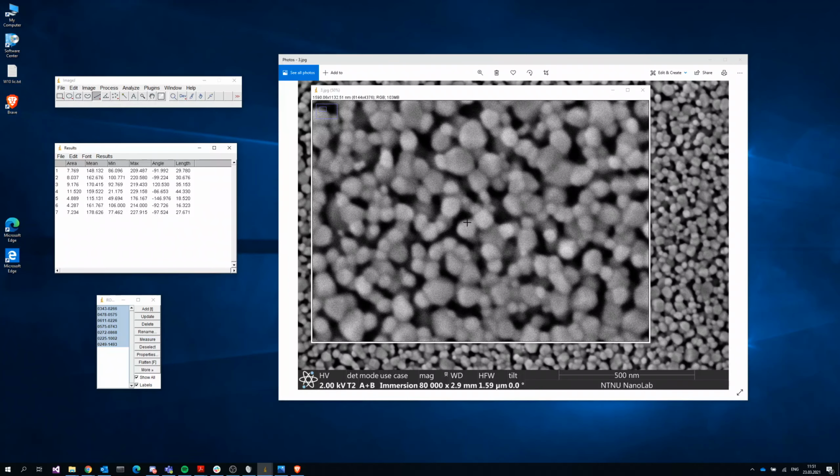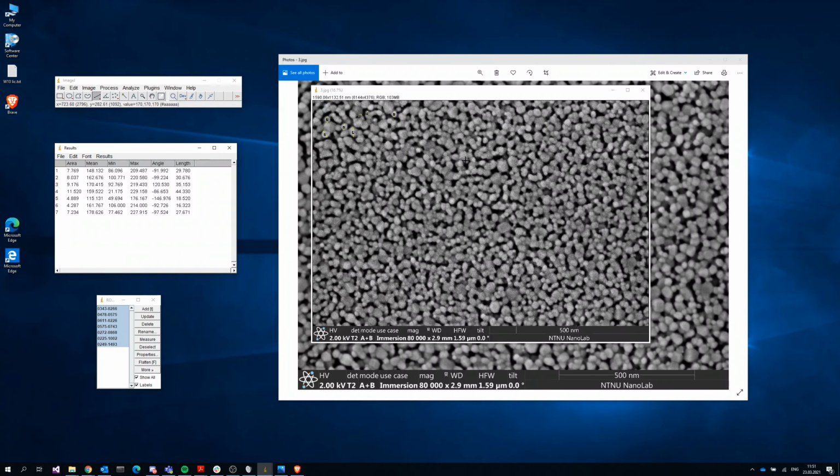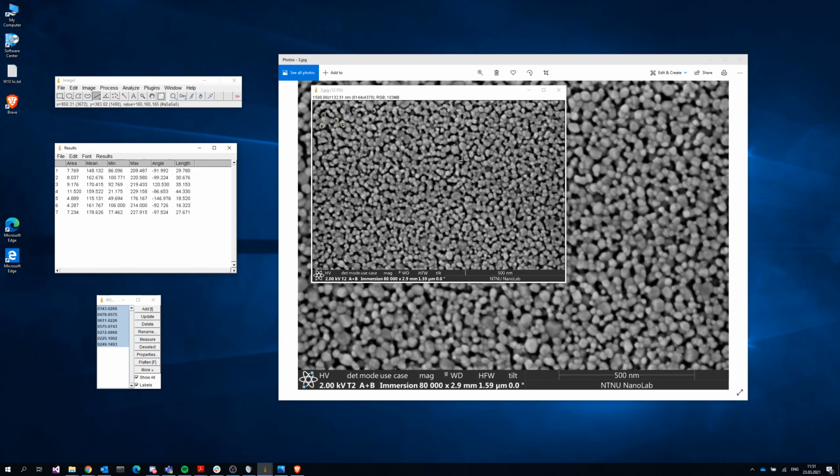Of course, it depends on how you take these measurements. If you take it this way or this way, it's going to be different every single time, but it's up to you how you will do this. It's important to discuss, or briefly mention, how the actual measurement taking affects the statistics. But basically from this we can take this into Excel, and that's when you'll do your histogram production, etc. So that's for nanoparticles.